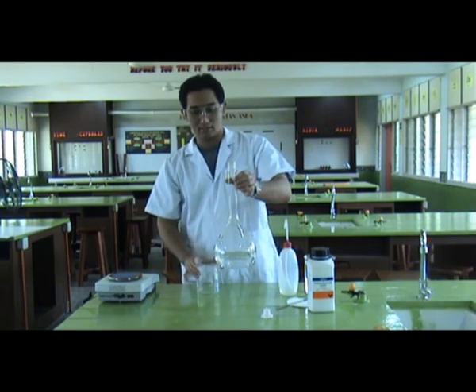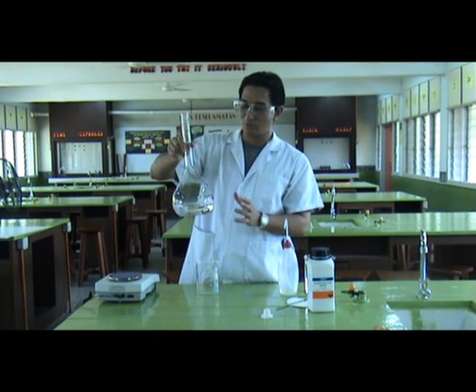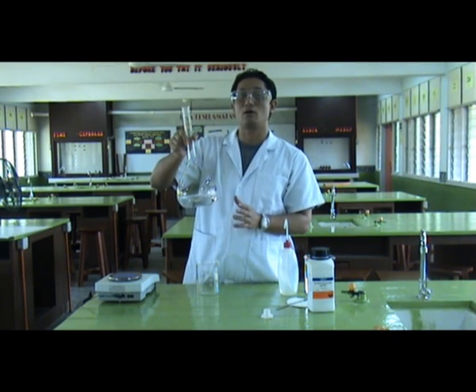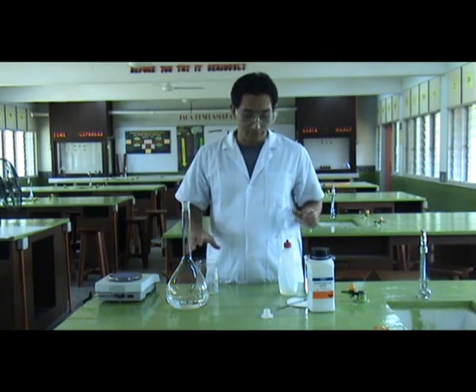Now we have half a litre of sodium hydroxide solution. Actually, this is not enough to contain one mole — it is not our target of one molar — because we have to add another 500 ml of distilled water.